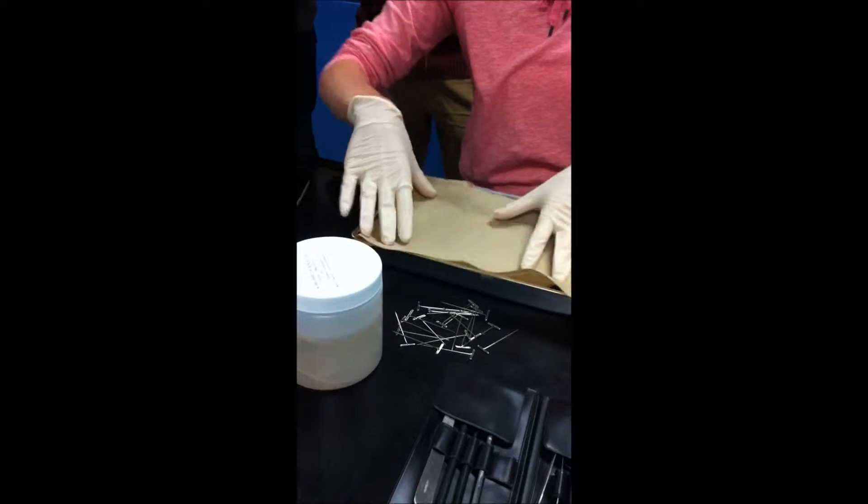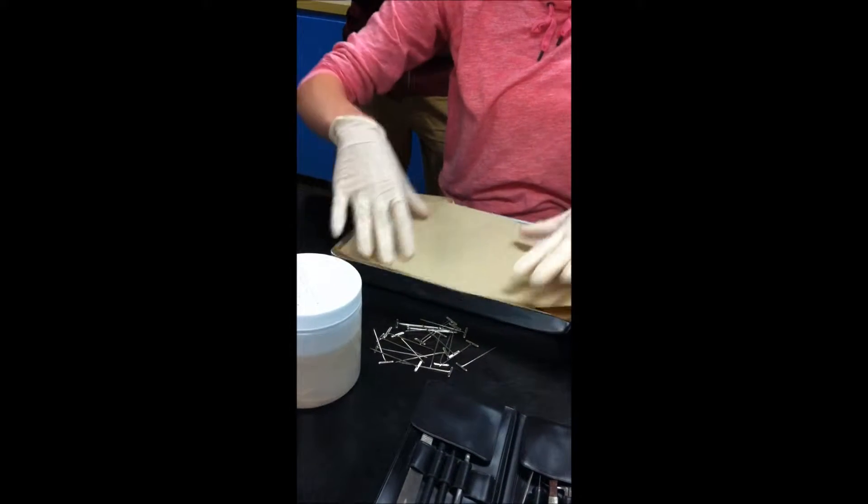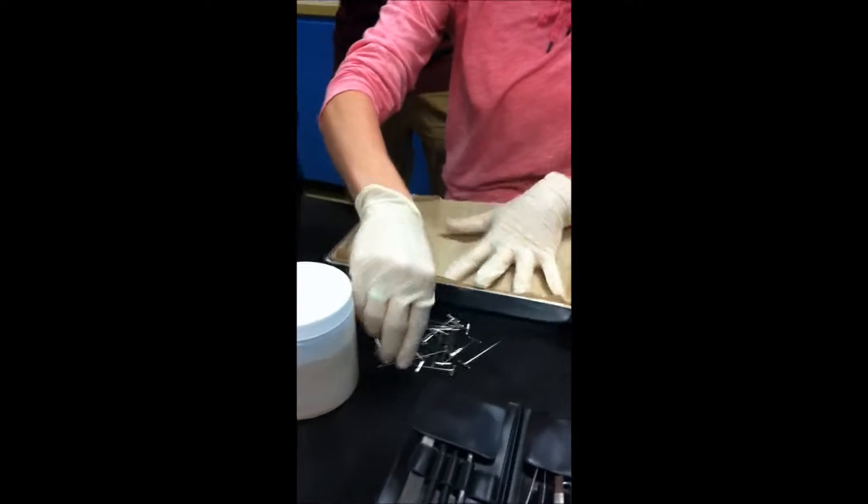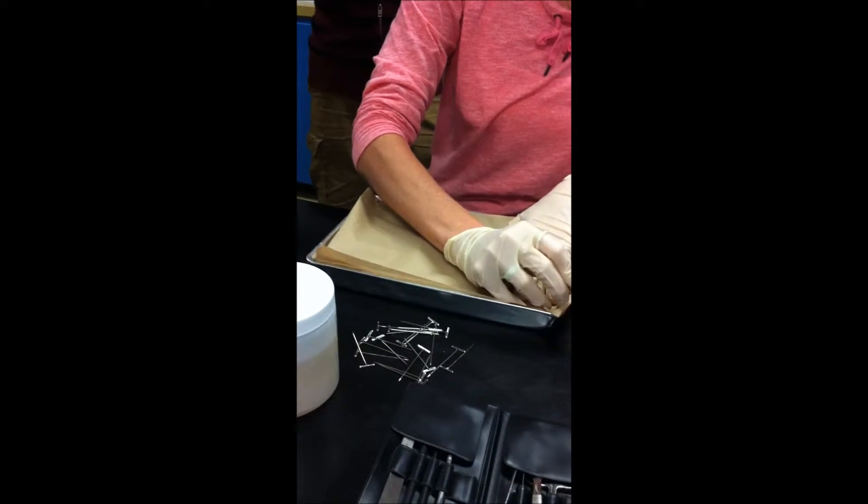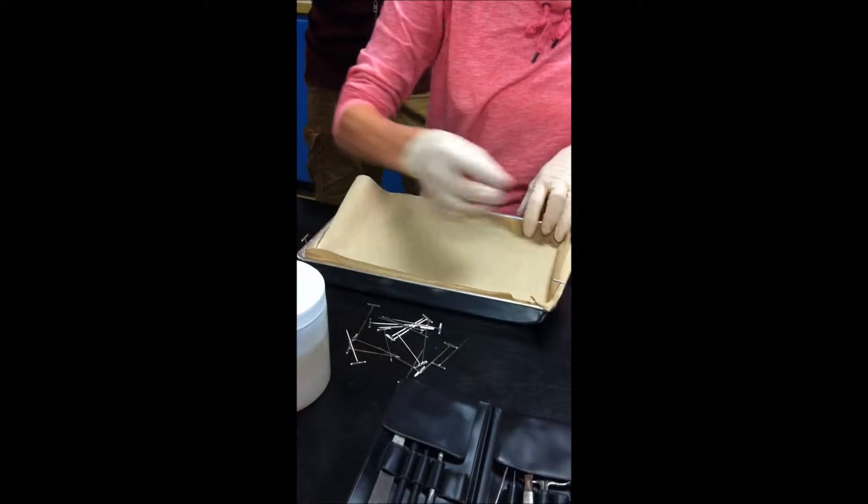Because some of our organisms that we're going to be dissecting are quite gungy. In other words, there's lots of liquidy grossness in there. So, having a piece of paper towel down helps with absorption of that, and it keeps the liquid at bay.